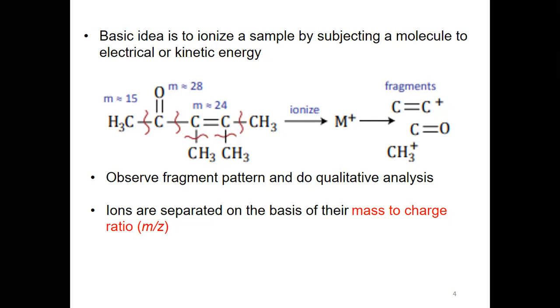That's why I specifically mentioned that, because when we do the analysis, since we are using +1, even though we know mass to charge ratio, our mind will automatically think, okay, if it is mass 20, then 2+ should also give mass to charge ratio 20. No, it's 10, right?